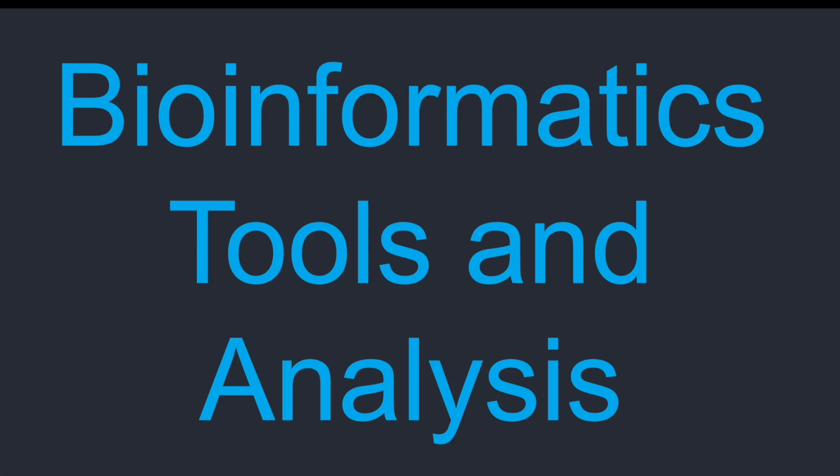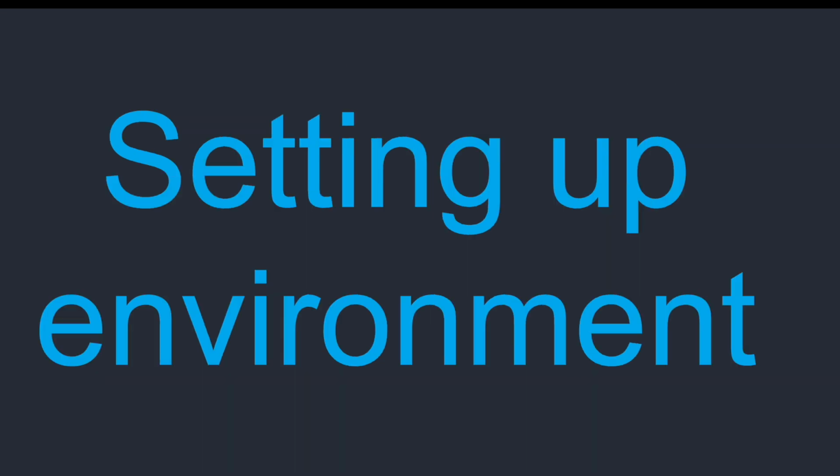Hello everyone, here I am starting another course, Bioinformatics Tools and Analysis. In this course, we will learn how to implement different bioinformatics tools. Before we start working on bioinformatics tools, it's important to set up our work environment.